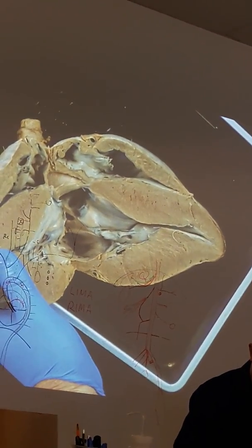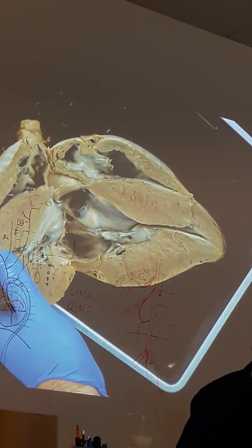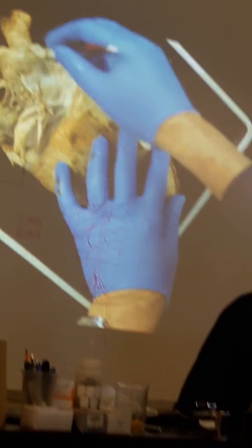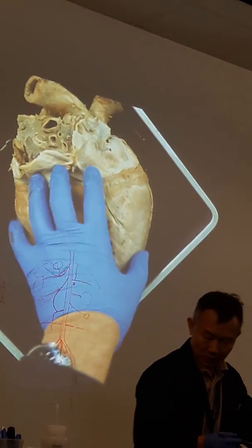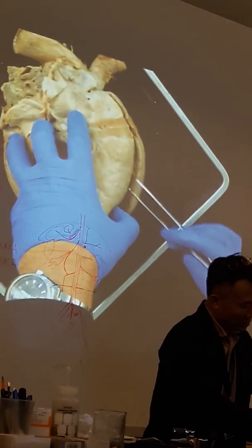The ductus arteriosus, we don't see that. Ligamentum arteriosum, that's all, so that's only the ligament. So okay, that's here. All right. So here. So that's outside structure. Then we open it to see the inside structure.